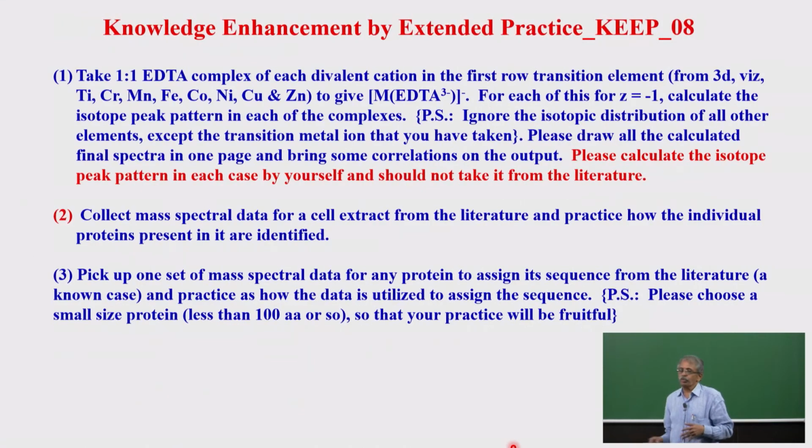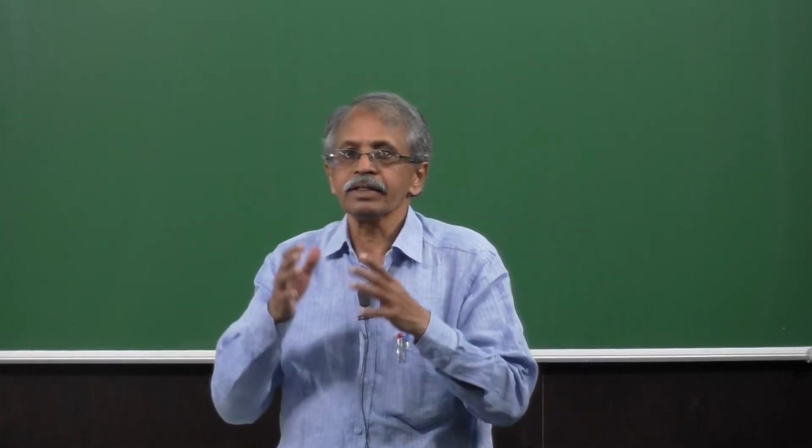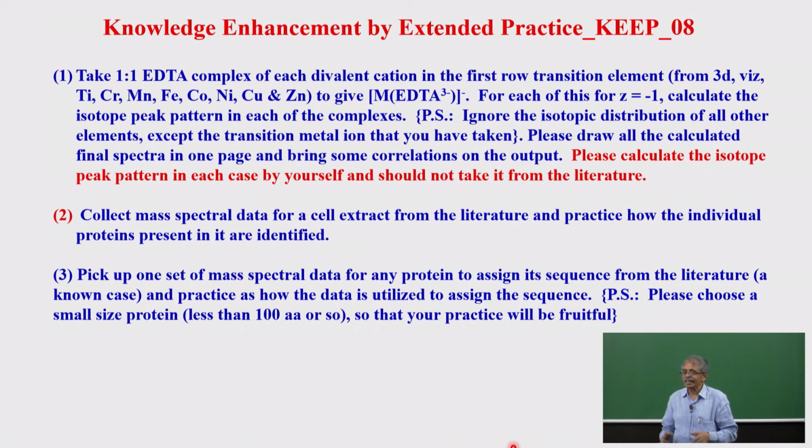Okay, so I hope you understood the mass spectrometry, particularly the electrospray ionization and the matrix assisted laser desorption ionization, which is popularly known as MALDI. I have explained all of them. So, they are useful for large molecules, particularly where you don't want to break their association, and where clusters, aggregates, etc. remain intact.